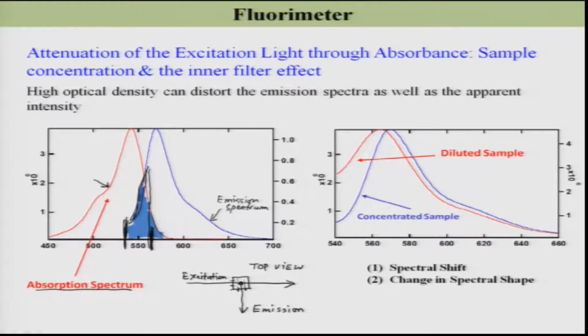So, I need to ensure that the emission intensity in this region is a real one, and not somewhat absorbed by the unexcited molecules.